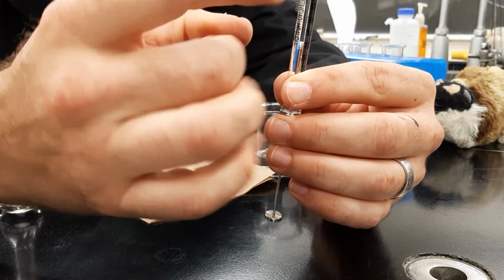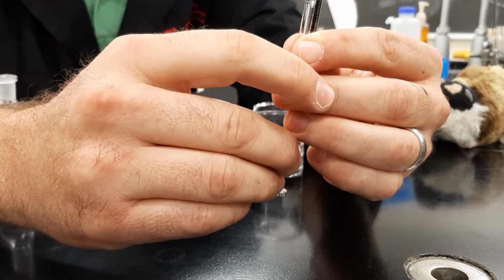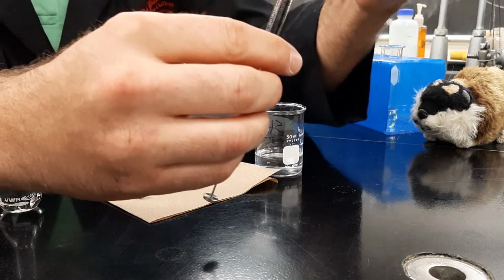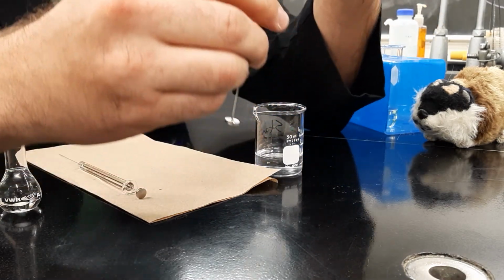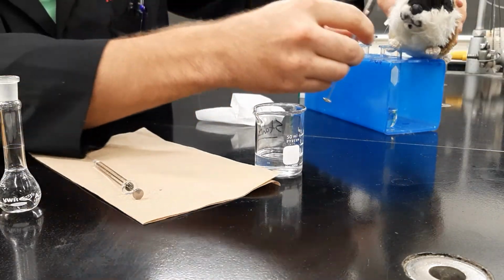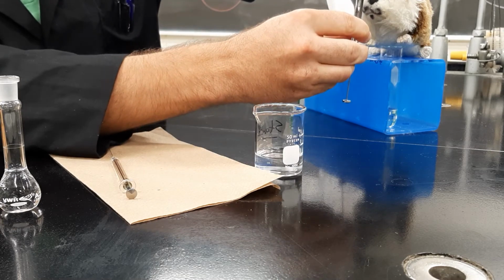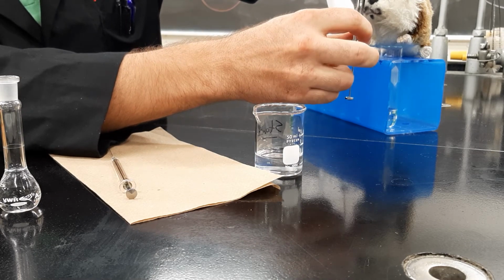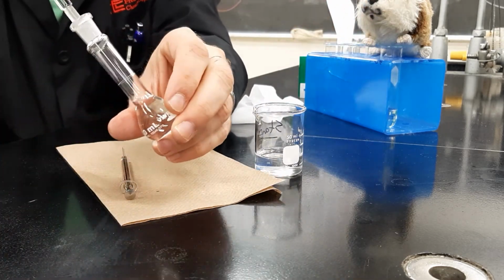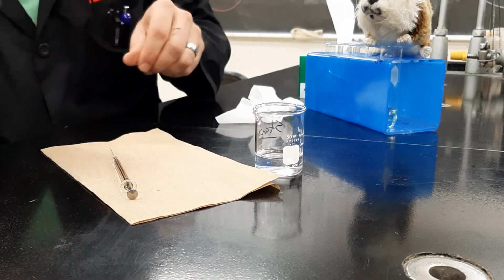You can just flip it up and it'll go up. Except the teeny tiny air bubbles are hard to get out there, so you want to pull in more air to expel it all as one big air bubble. At that point, you bring your face down. I think Lewis will do this for me. In line exactly with the level you're trying to measure from. You bring the plunger to wherever it is, and then you're done. Bring it over and inject it under the surface of the liquid, just like the other one.